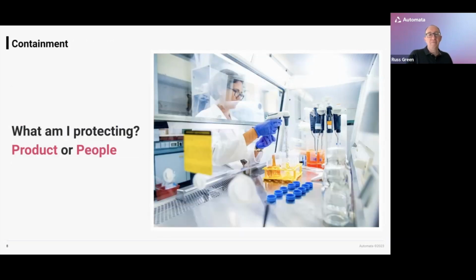A little bit about containment as well. I was going to speak about this picture earlier on, and I moved it to here because I think it's more pertinent. This is the classical image that comes to mind when you think about a bench scientist doing some form of tissue culture, sat with their arms poking through a hood, hour after hour, moving liquid around using long pipettes. And when we think about that kind of containment, that is ubiquitous in tissue culture labs.